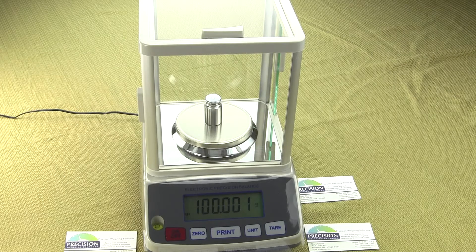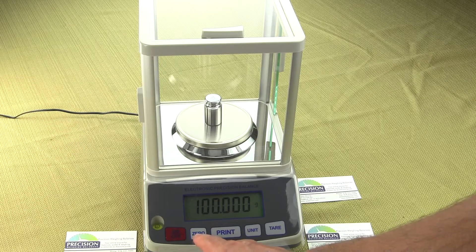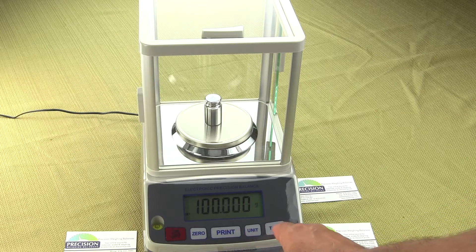We have the 100-gram calibration weight that comes with this balance. This is just a steel, chrome-plated weight. The weight is made in China. There is no traceability and no stamping of what class it is. So it's just a low-cost calibration weight that does the job. You'll notice you have, across here, five buttons to control the balance: an on/off, a zero, a print, a unit key, and a tare key.